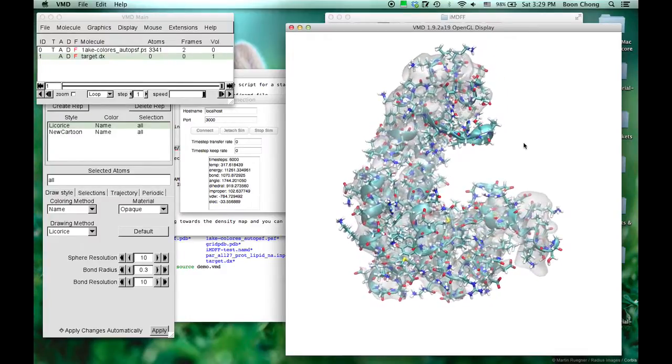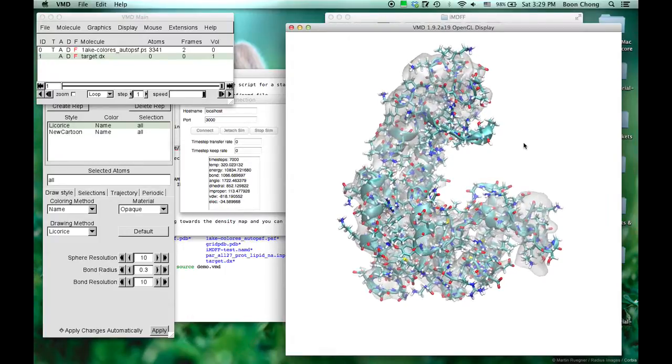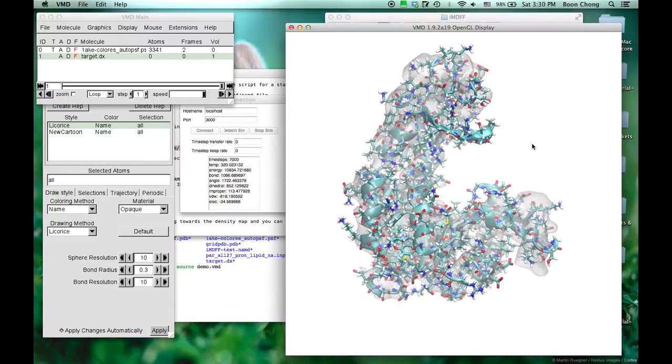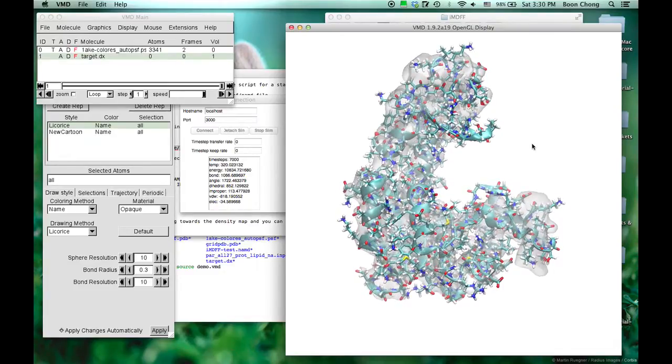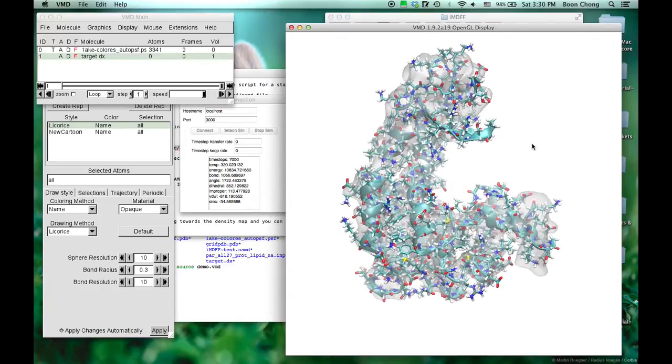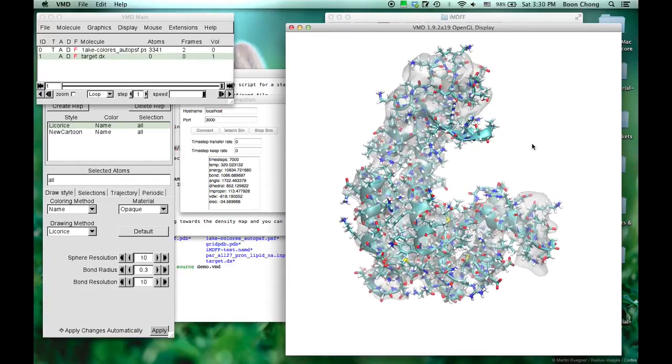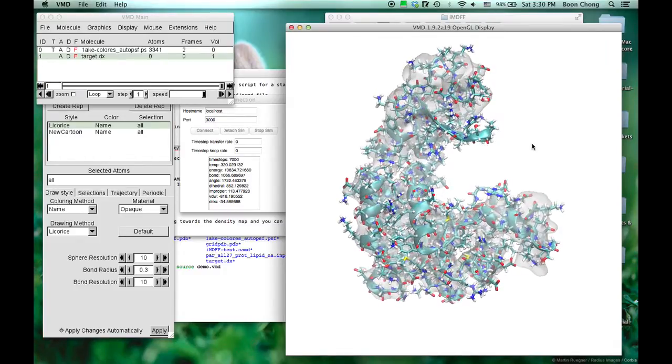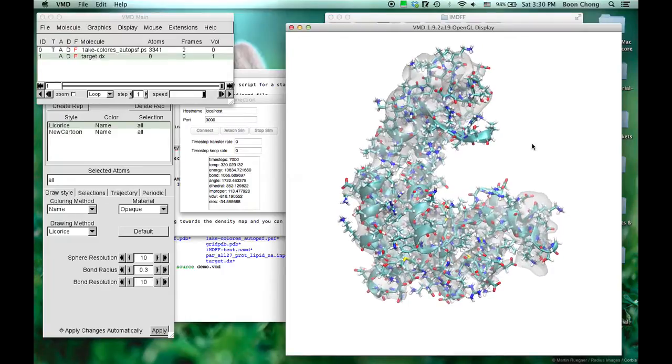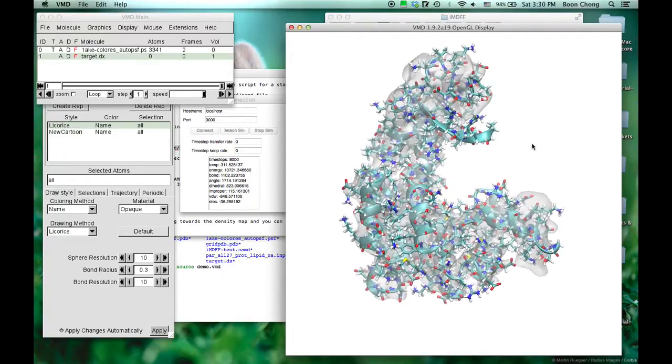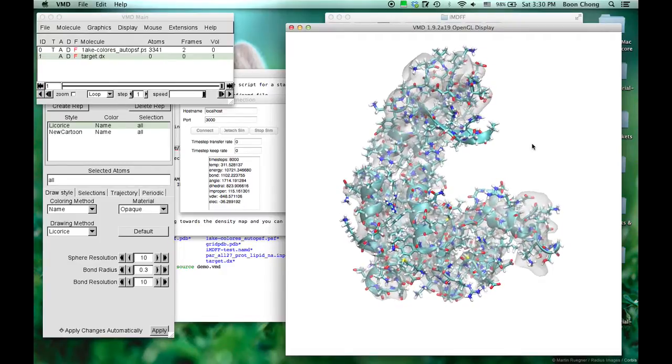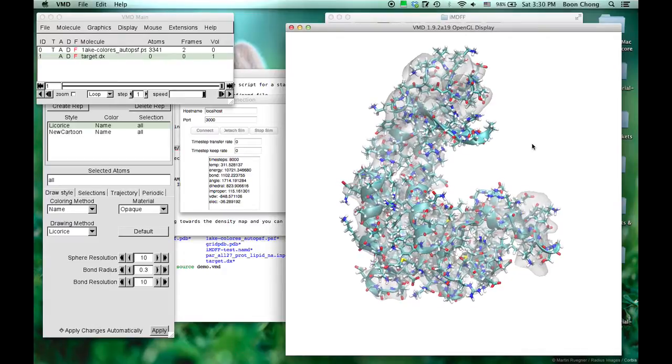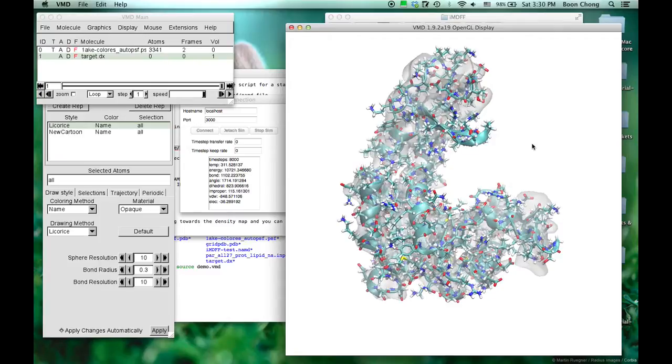Of course, I'm just illustrating it to you. In a real MDFF calculation, you want to do it slowly and carefully. But why interactive MDFF is useful, other than for demonstrative purposes, is that sometimes when the molecule is a bit more complicated, the computer doesn't quite know where to go. And that's when you want to assist and try to pull it to the correct direction.